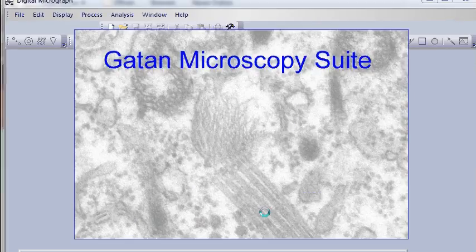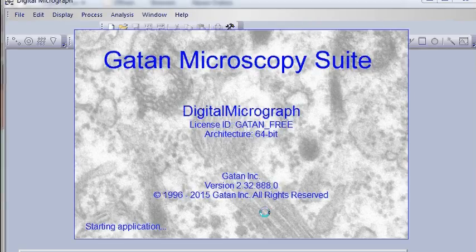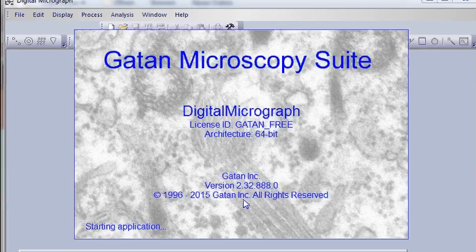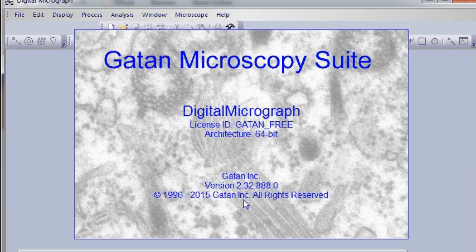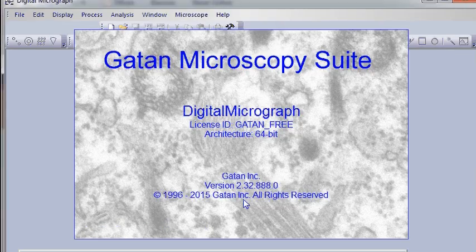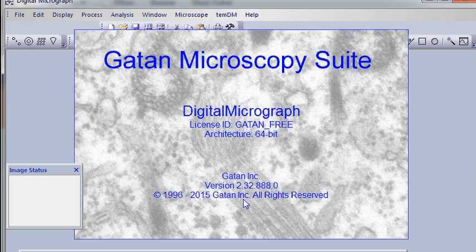Yeah, it takes some time. I have here version 2.3. But basically this plug-in is supposed to work with any version of Digital Micrograph. Good.